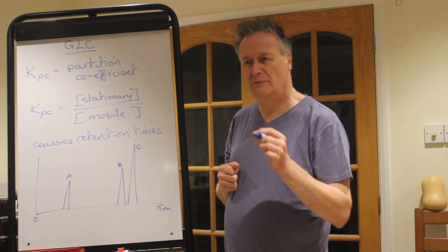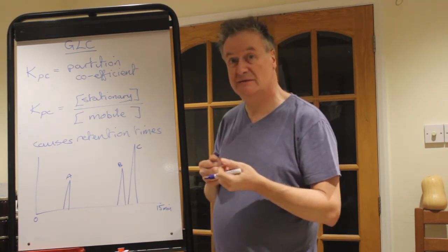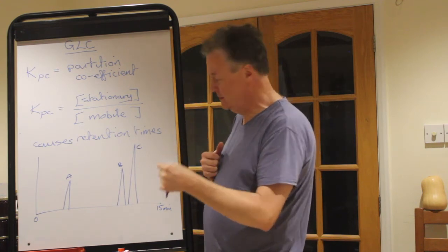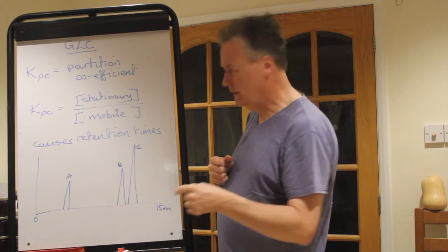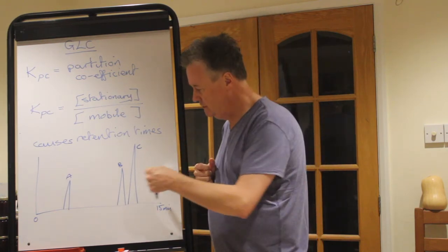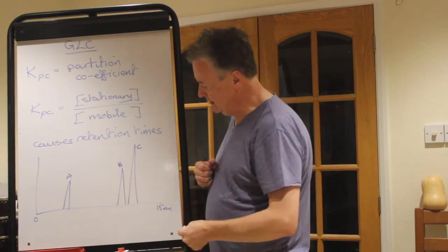Now that should ring a little bell, like that's a bit like isotopic abundances when you're looking at mass spectroscopy, because the analysis of it would be the same. The area of the peak is equivalent to the height of the peak in mass spectroscopy, and that's also true for NMR as well, the height of the peak or the area underneath the peak tells you how many atoms you're referring to with that chemical shift. So it's a similar sort of thought process. So more C than B and marginally less A.